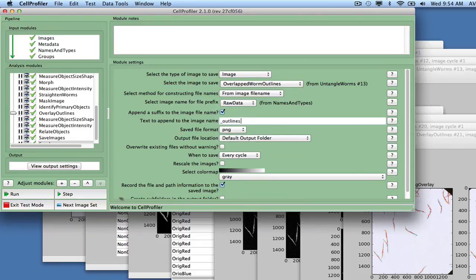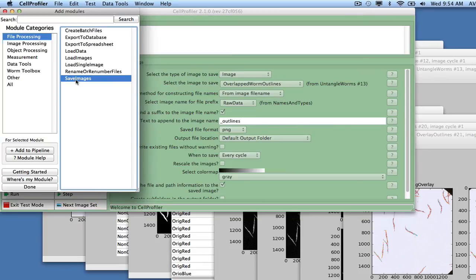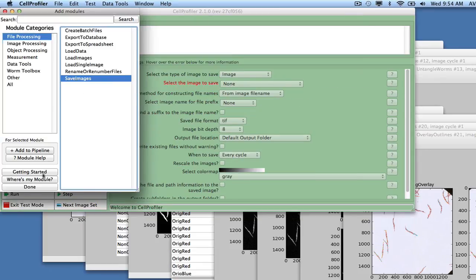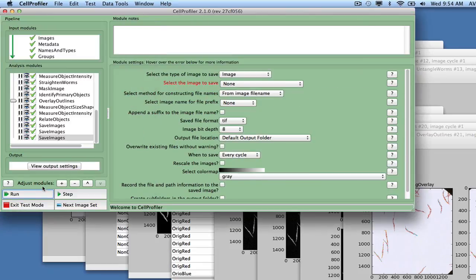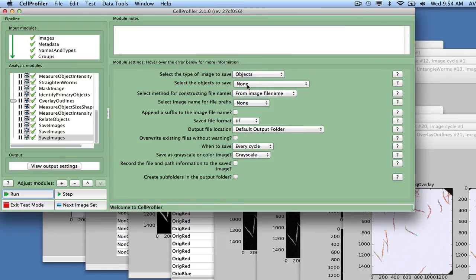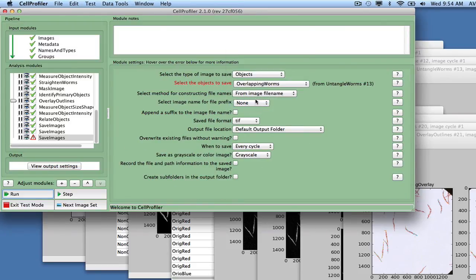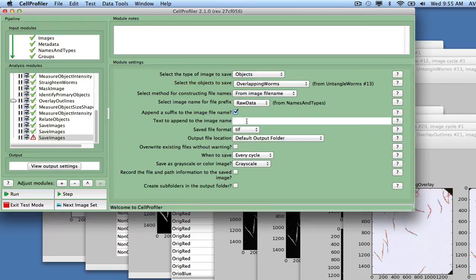Add a third Save Images module to save the segmentation masks called Overlapping Worms, and save them as objects, with the file name extension Underscore Worm Underscore Objects, and the format as TIFF, which is the only format for saving overlapping objects. These will be used as input for pipeline number 4.